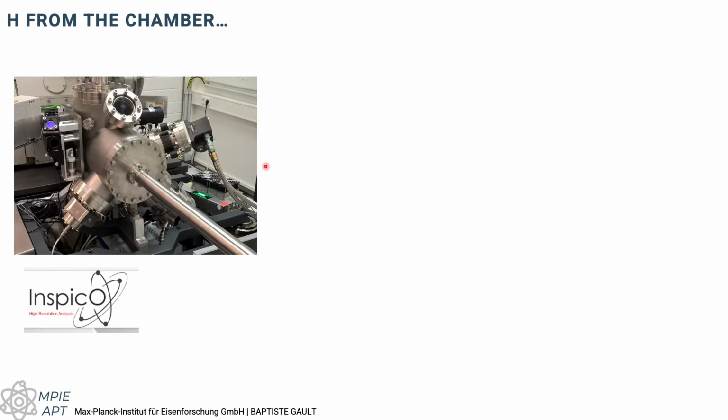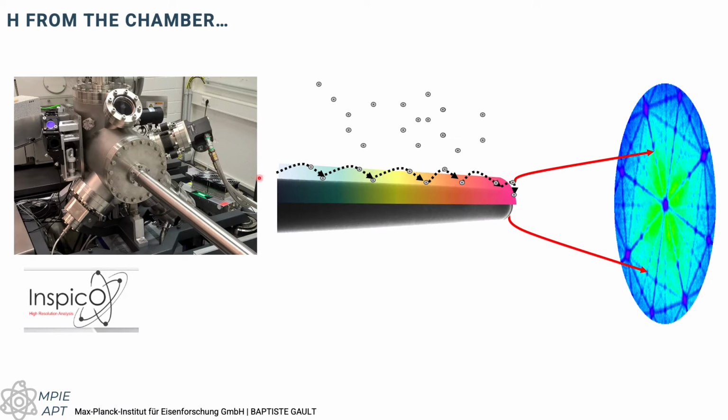Amongst the issues regarding quantification of hydrogen in atom probe is that every atom probe is more or less something looking like this, a stainless steel UHV chamber, ultra high vacuum, so it always contains some degree of hydrogen inside of the chamber. And when we start doing the analysis, there might be hydrogen because the specimen is kept cold, hydrogen will be attracted to the specimen.